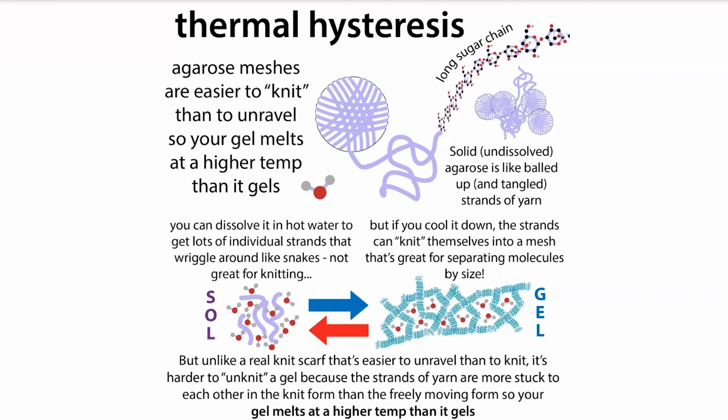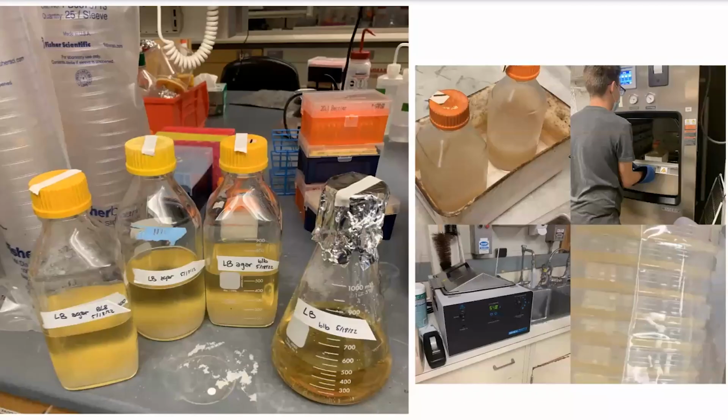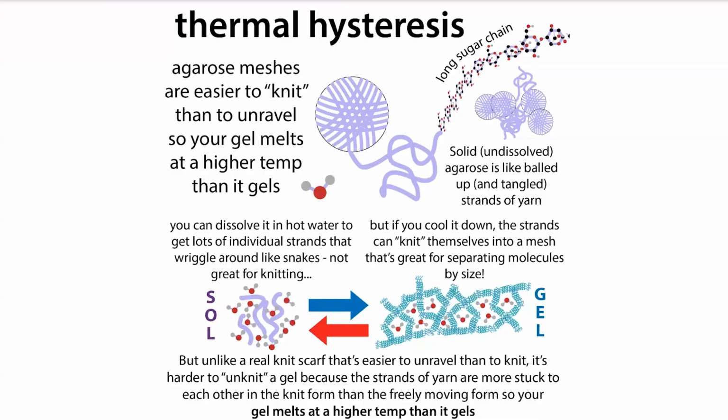But if we then want the gel to melt, we can get it higher again, such as if we didn't pour that agar in time, so we can actually make it ahead of time and then microwave it when we're ready. Or if we want to melt the gel to purify the band of DNA out of it. So this property of reversibility is going to come in super duper handy. And that's a property of both the agarose and the agar.